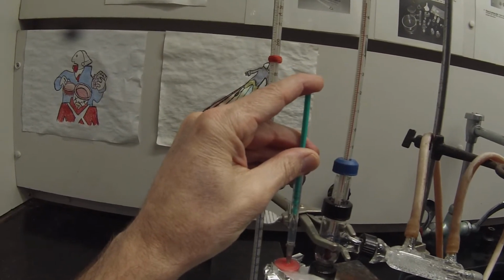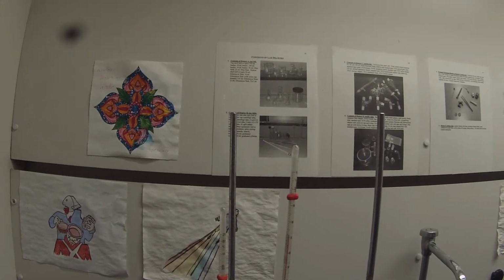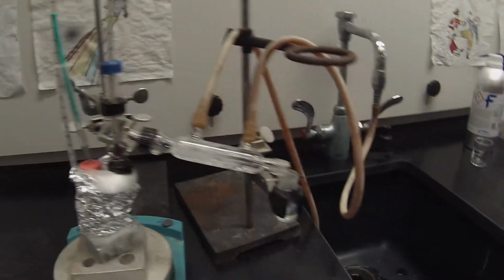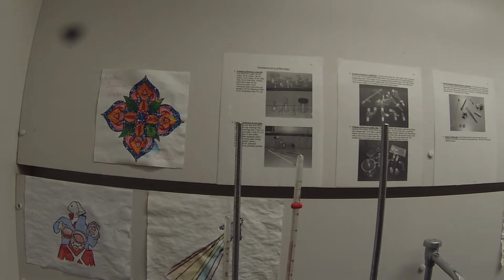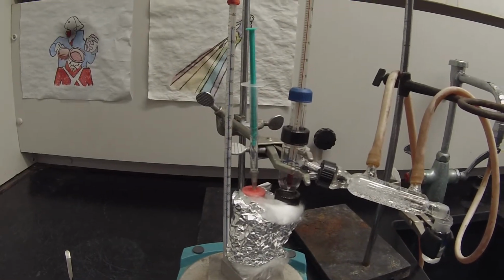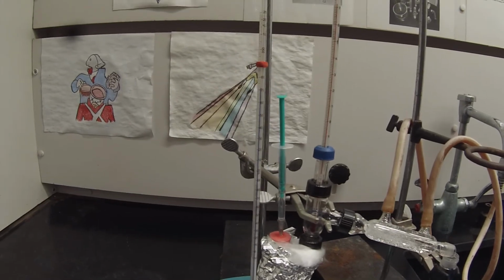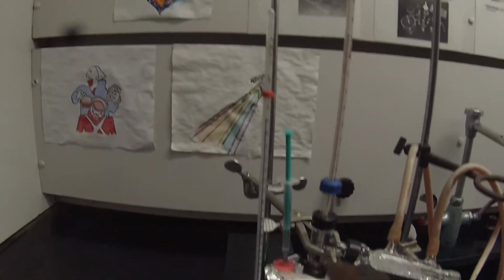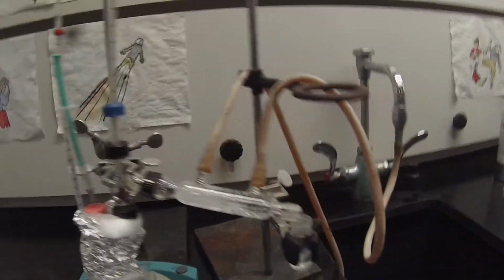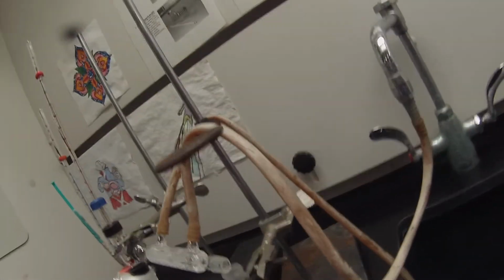So this time I'm going to add another milliliter. Add that a little faster. That should get this to distill a little bit more. And you can see that that had the effect of raising that temperature up. And you're full of liquid in there now. Still haven't seen anything drip off the tip. It does look like there's some liquid sitting there.